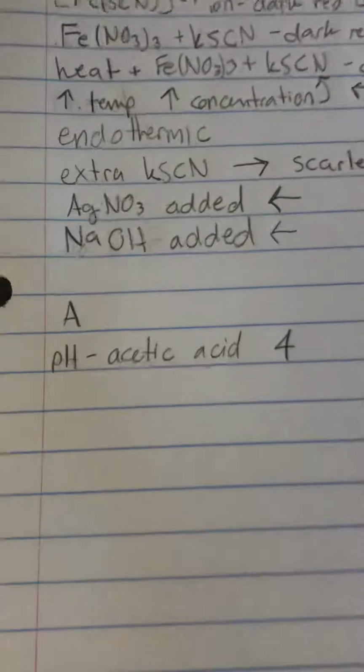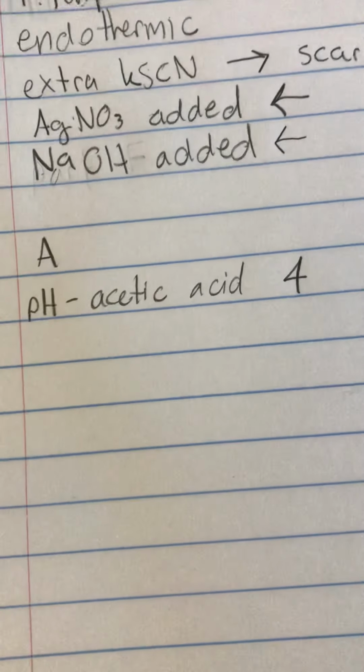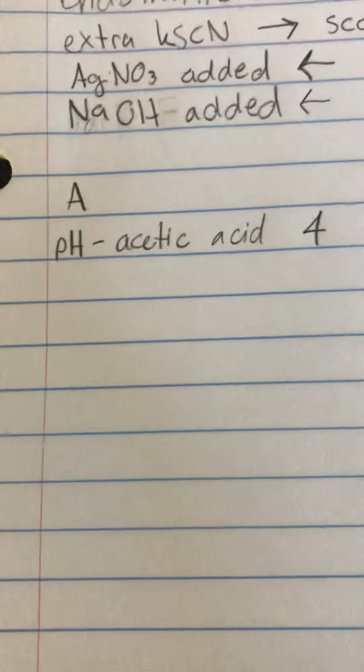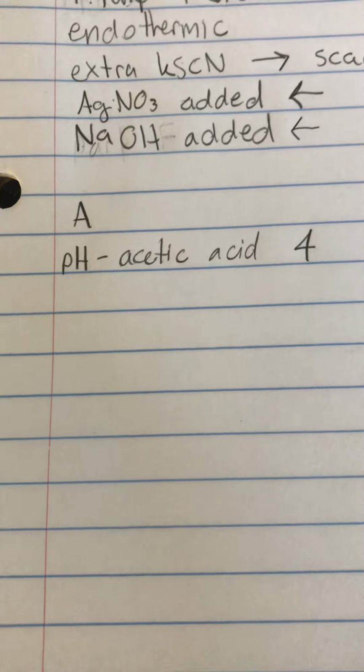So 4 is less than 7. So anything less than 7 is acidic, and that was taken as a reference to see how it would change when sodium acetate was added.